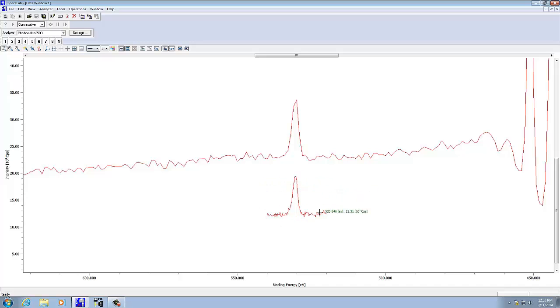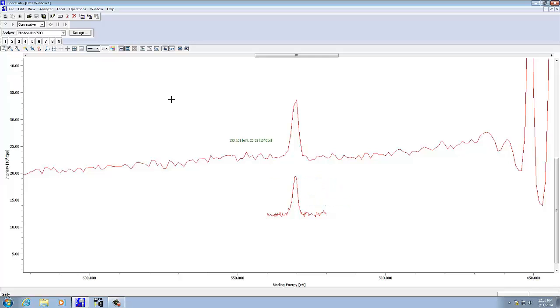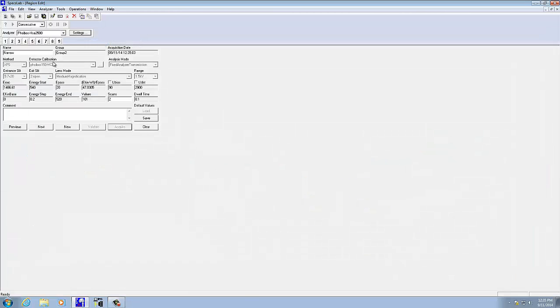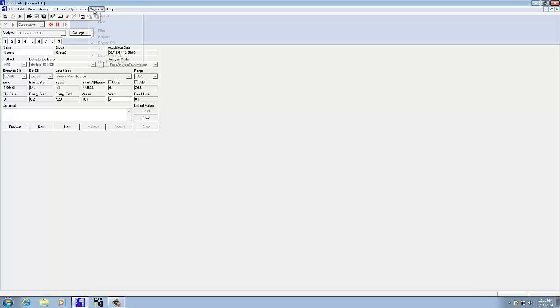The number of counts per second goes down, but my energy resolution will go up or get better. In this case now, this is just 2 scans. If I was trying to peak fit this, probably not good enough. What I would then do is go back to regions edit, make sure I'm on the narrow, and let's say we change that to 5.